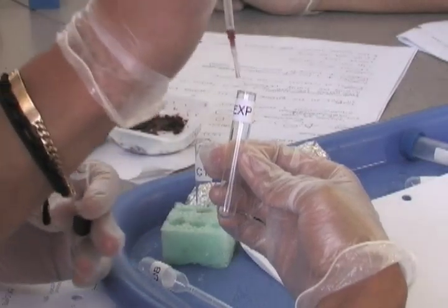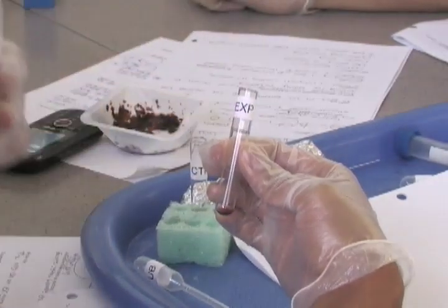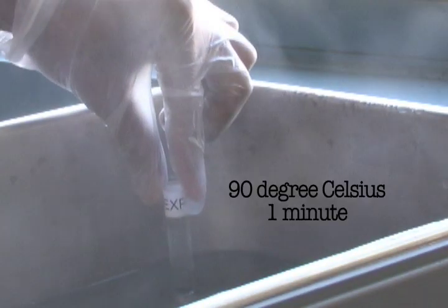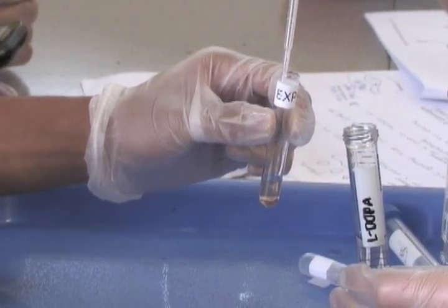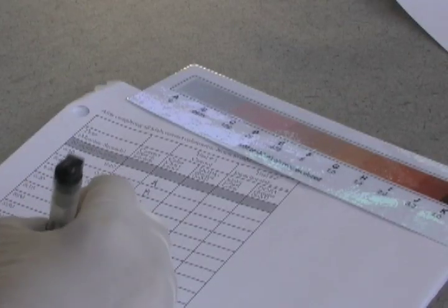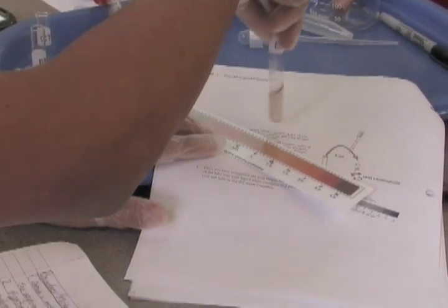If you would like to choose the temperature trial, add 0.1 milliliters of tyrosinase to the EXP tube. Place the tube in 90 degrees Celsius water for 1 minute. After this, add 2 milliliters of L-DOPA to the tube and record your color change at time intervals. Make sure you add all of the L-DOPA at once, and start recording immediately.